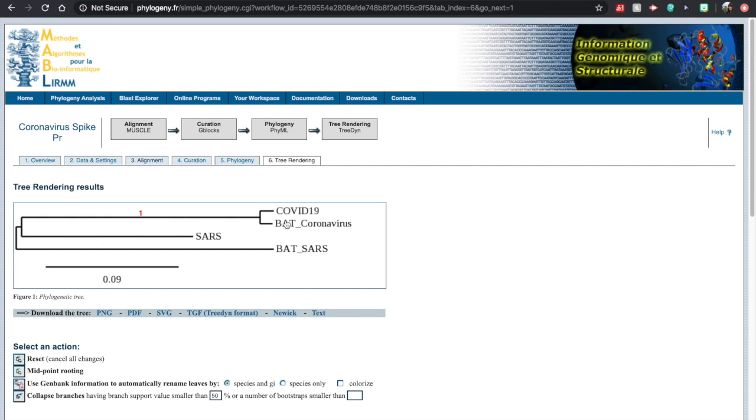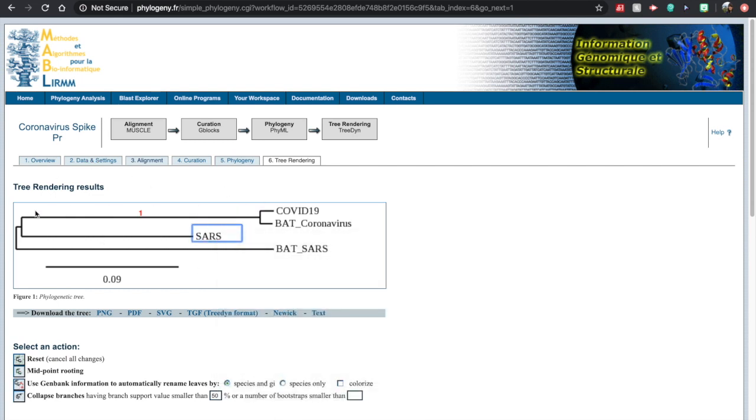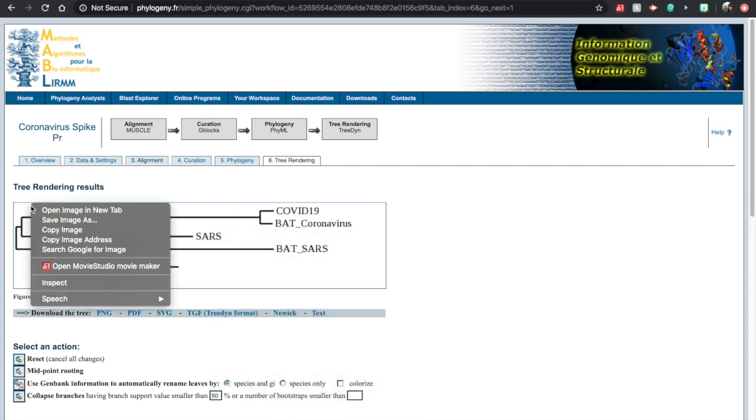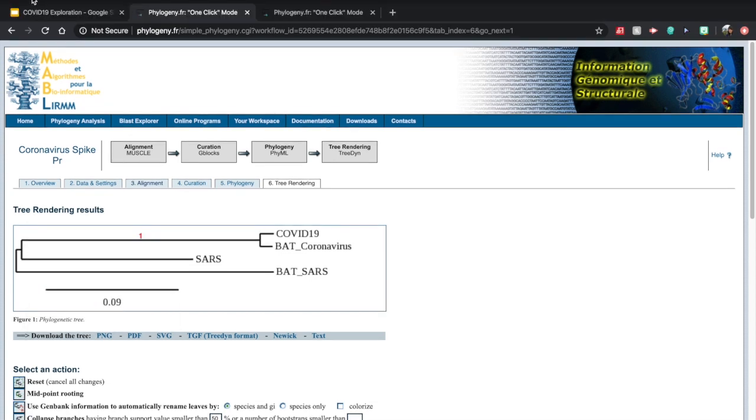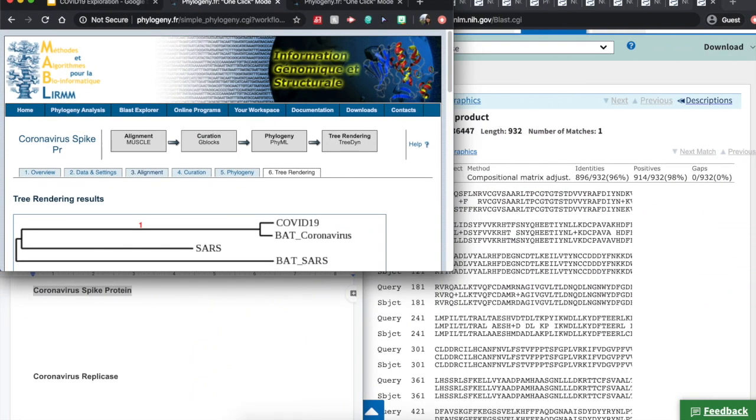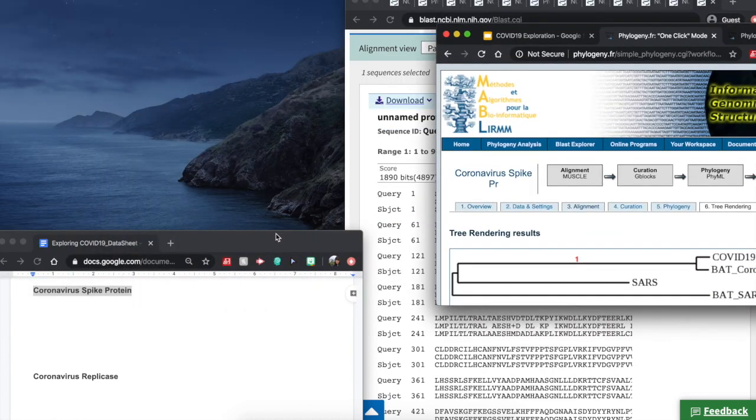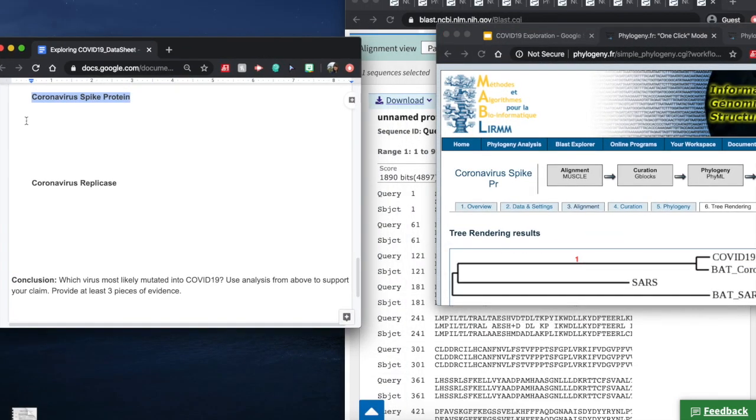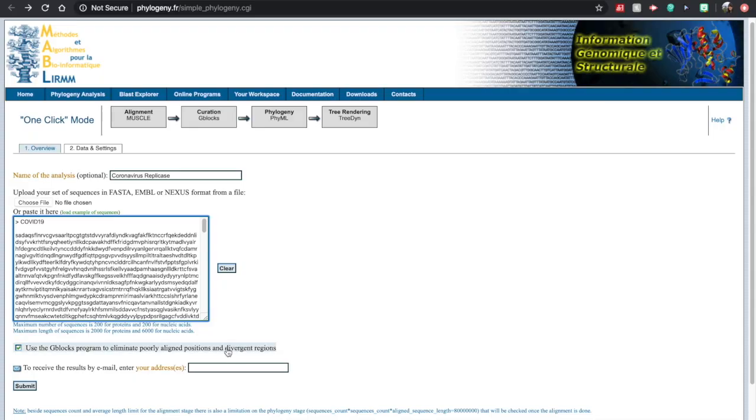And so here is our tree. So I'm just going to right-click on this. And from here, it's going to allow me, I can then copy and paste it directly into my data sheet.